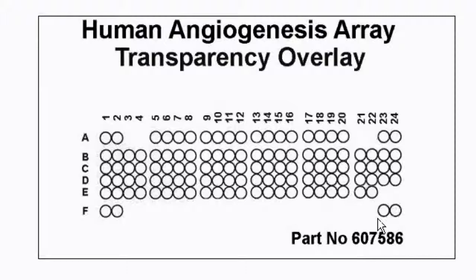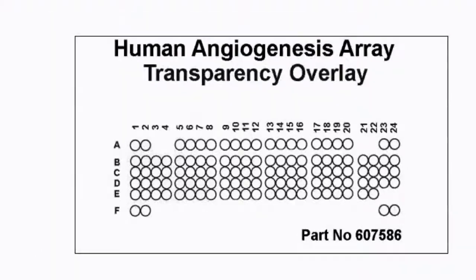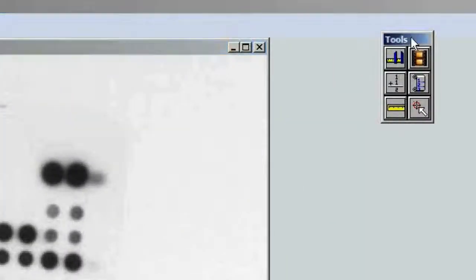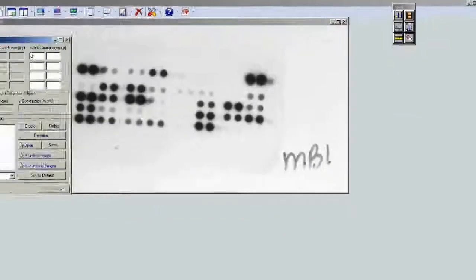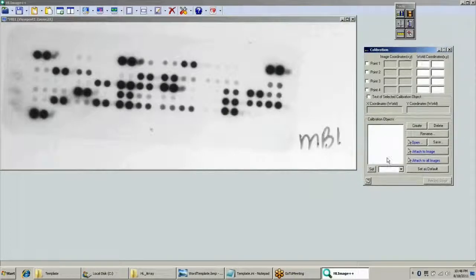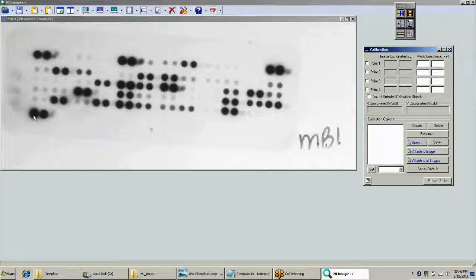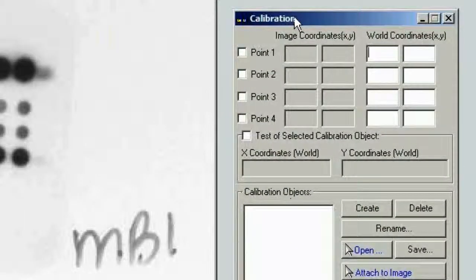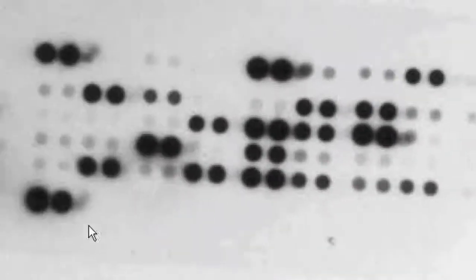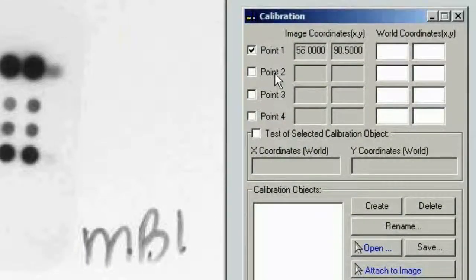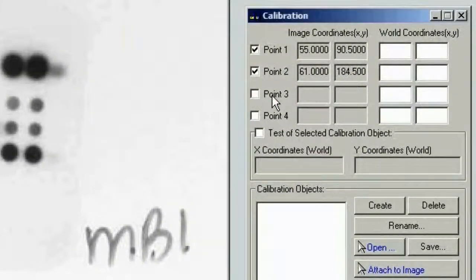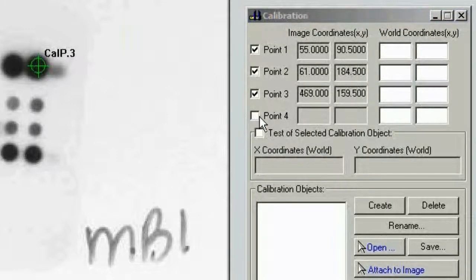The way you do that in software is using the calibration tool in HLImage. For good calibration, we want to use four points on the image in the four corners: lower left, upper left, upper right, and lower right. You start by clicking point 1 in the calibration tool, then left-clicking in the middle of where point 1 should be on the image. Then we do the same for points 2, 3, and 4.